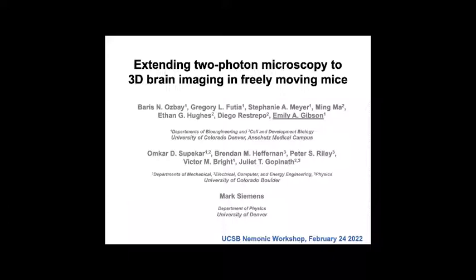My talk has the same title as what I've talked about previously, but I have added some new stuff. In the first part, I'm going to talk about extending two-photon microscopy to imaging in freely moving mice. And for the second part, I'll talk about some work we've done on fiber-coupled two-photon STED imaging.